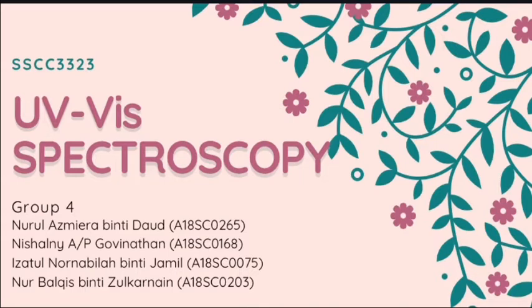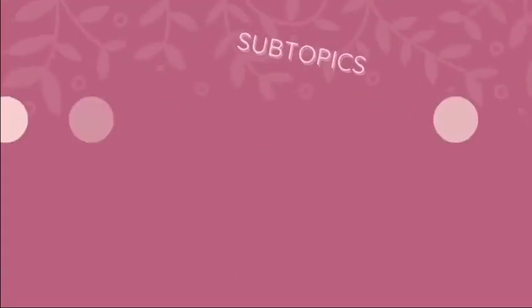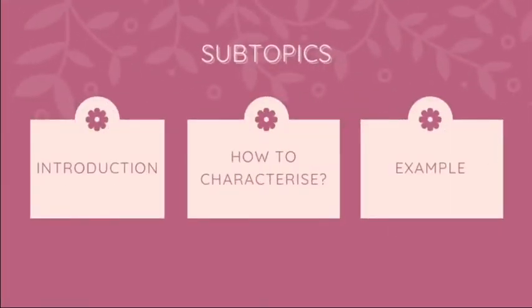The topic of our presentation from group 4 is UV-VIS spectroscopy. As we know, UV-VIS spectroscopy is one of the important methods for polymer characterization. Hopefully the presentation will make you understand more about this topic.